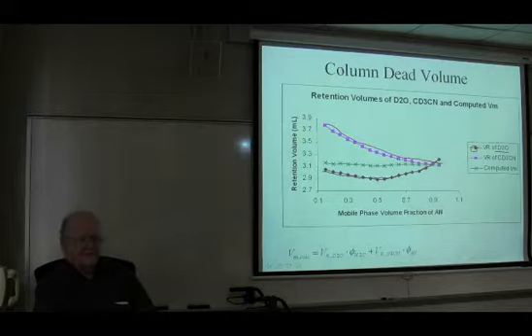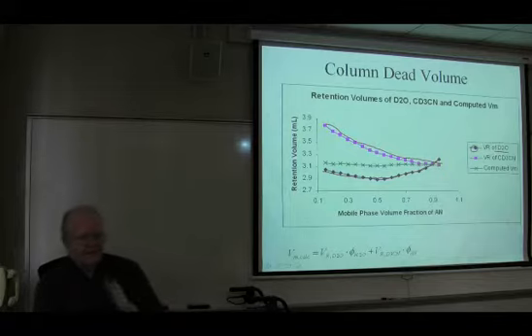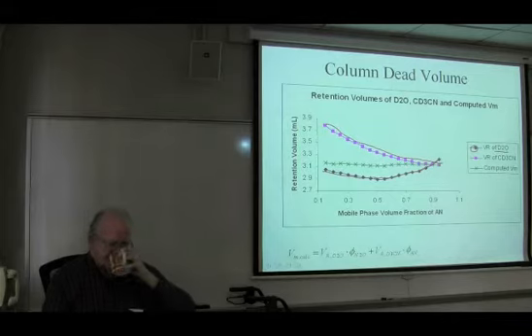Why does this happen? It happens because even water and even acetonitrile adsorb into the stationary phase. And the amount that adsorbs depends upon what the concentration of the eluent is in the mobile phase. There's not a lot of adsorption, but there's very definite adsorption of water, acetonitrile, methanol, especially THF, into the bonded phase. There's no doubt about this.